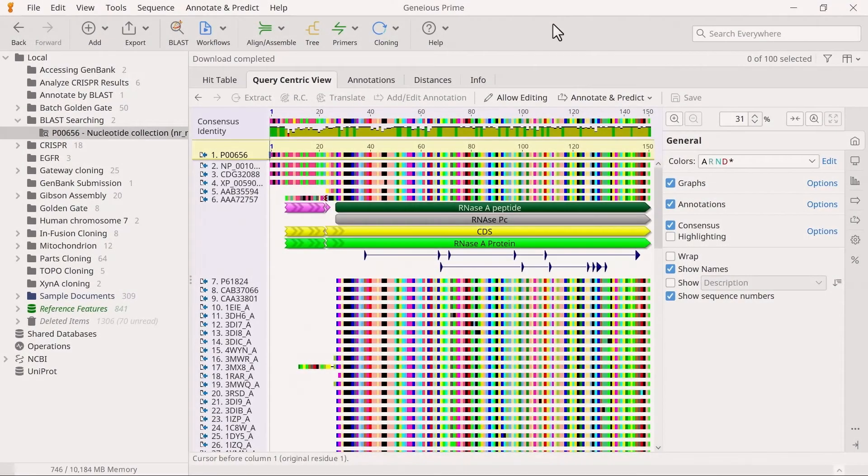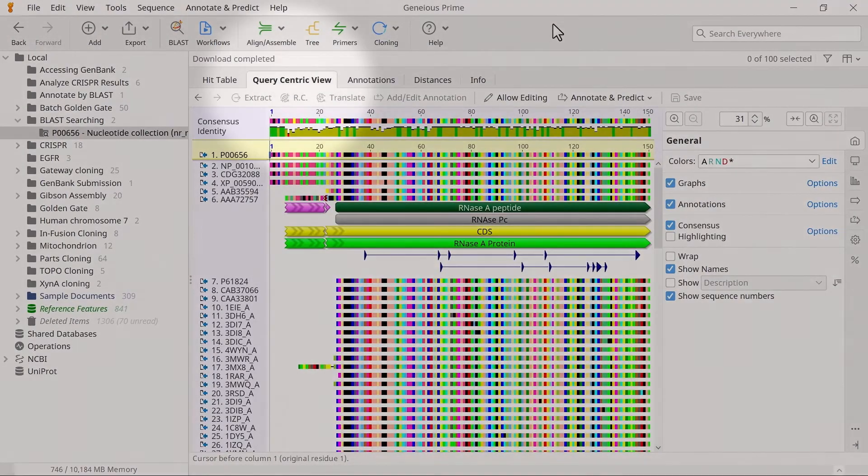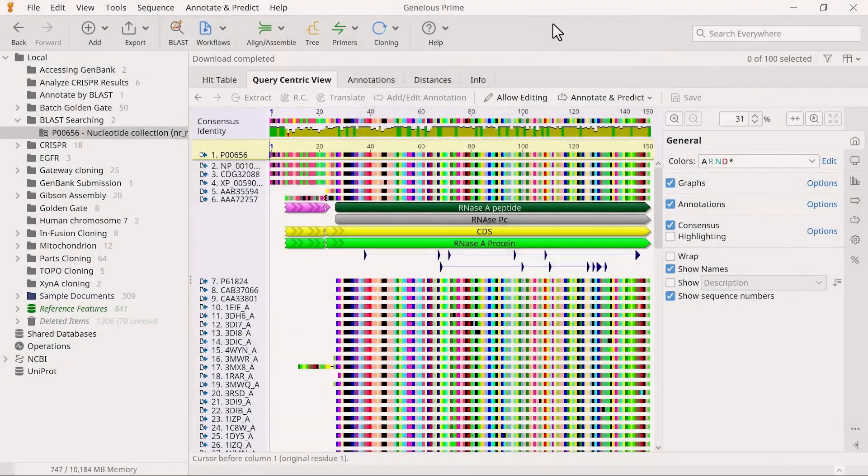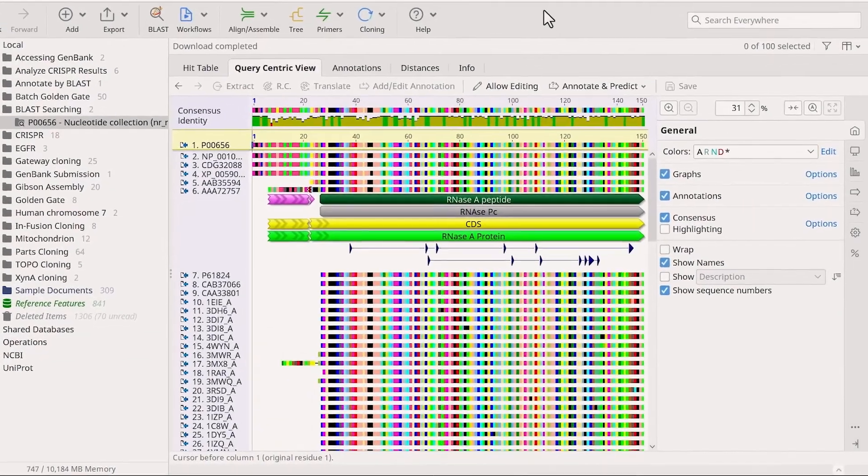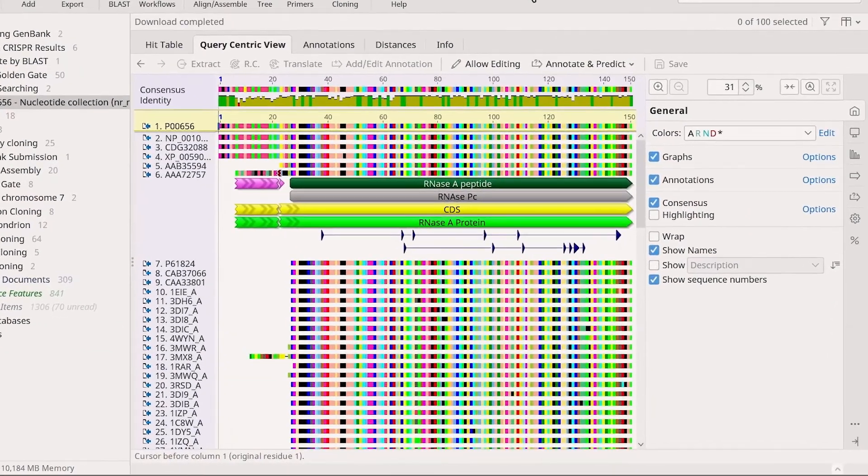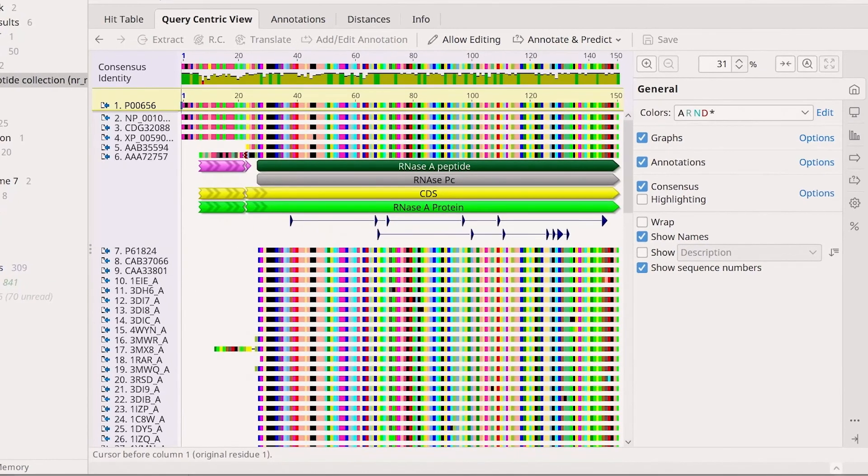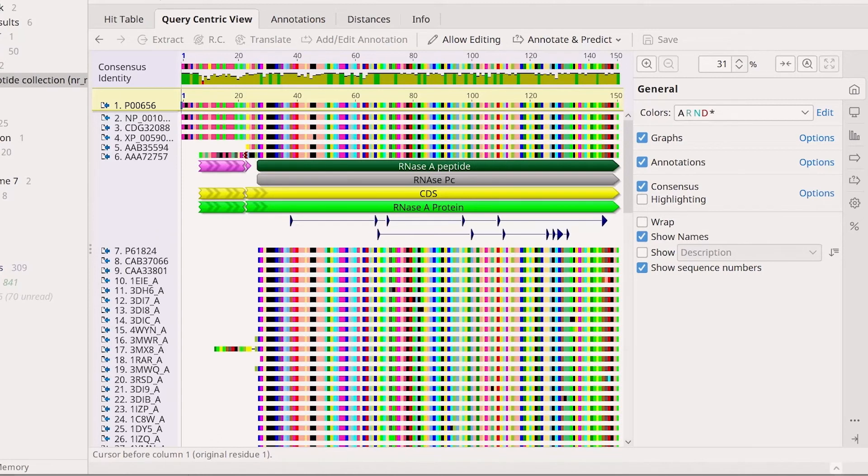Now, let's take a look at the query-centric view. Query-centric view is useful for visualizing all the hits against your query in one window, allowing you to see where the conserved regions of your sequence are.